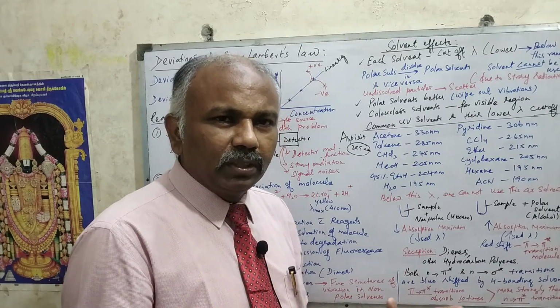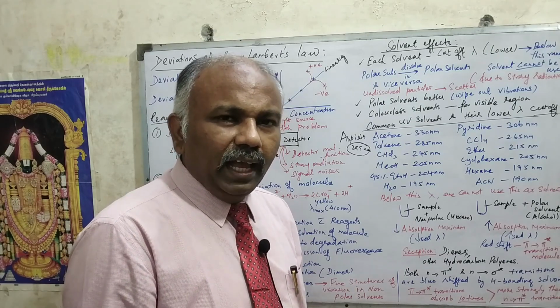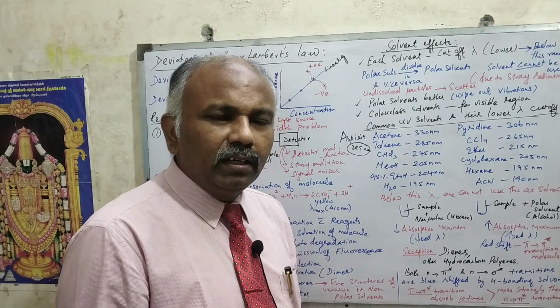So this is all about the various aspects of reasons for deviation of Beer-Lambert's law, as well as the solvent effect on UV visible spectroscopy.